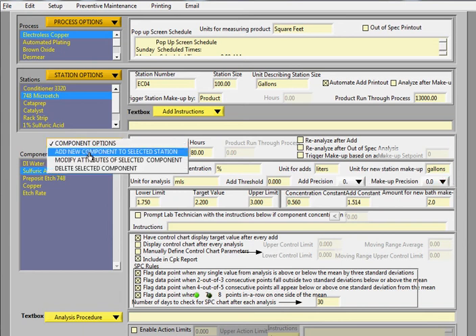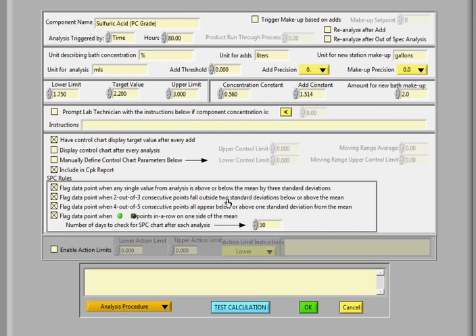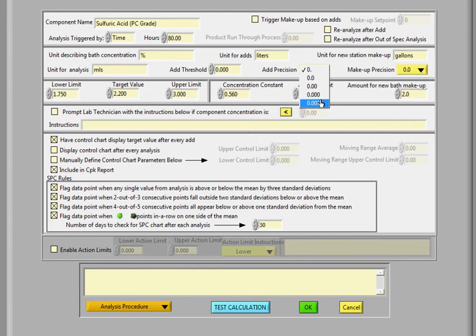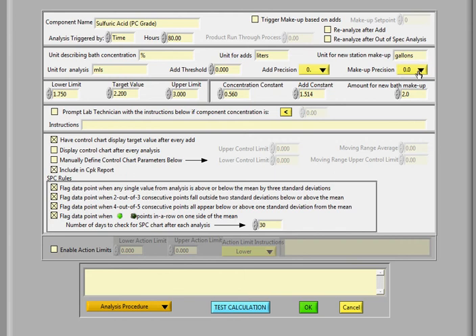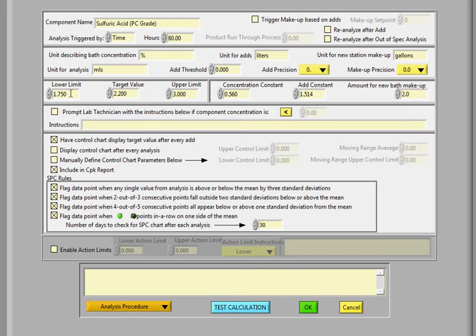Add precision and makeup precision. So in this case, you want to modify those. You can choose the precision that you want the technician to do his or her measurements to. And the add precision and the makeup precision.